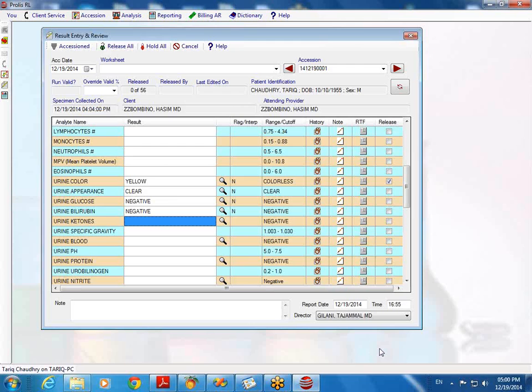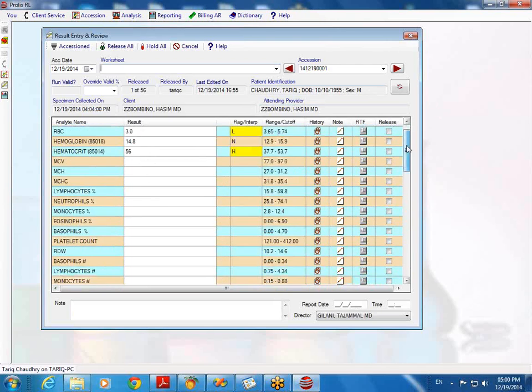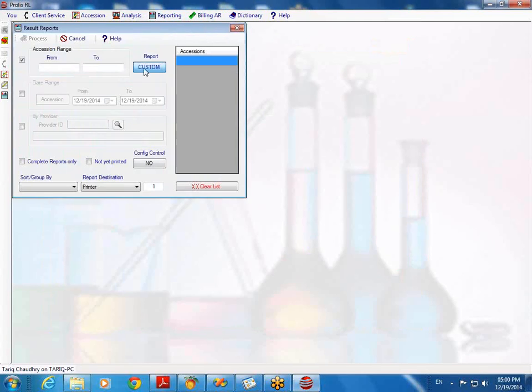Lucia, did you have any other questions? No, that's it from me. Let me show you quickly the report, and then we are done. We have entered some results, and most of the results are blank. So let me run this report, and then I think we will be able to conclude the session.